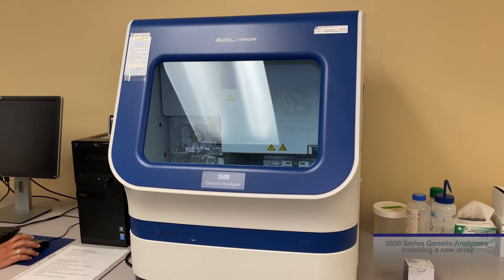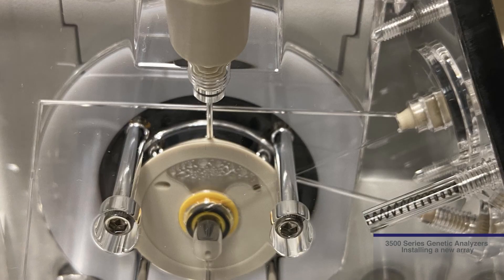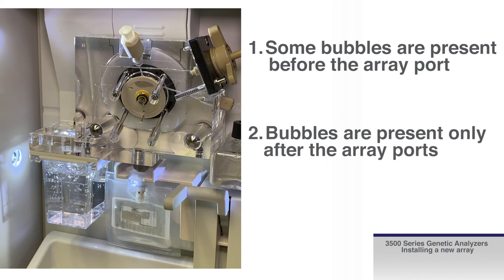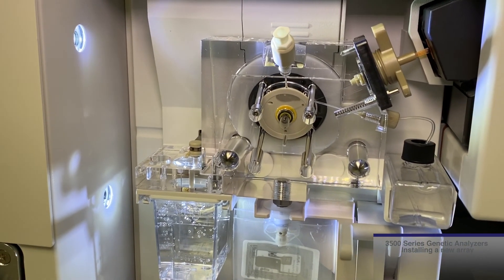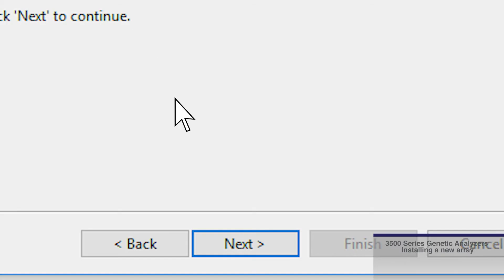After the prime pump command, the wizard will ask if bubbles are present around the pump block channels. Take a close look at the pump block and channels — the interior light can be turned on for better viewing. There are three options for addressing bubbles based on their position: some bubbles are present before the array port, bubbles are present only after the array ports, or all bubbles are gone. More polymer is used if bubbles are present prior to the array port. Select the option that best fits and repeat as necessary to remove all bubbles. Once all bubbles are removed, select 'Bubbles are gone' and then click Next.